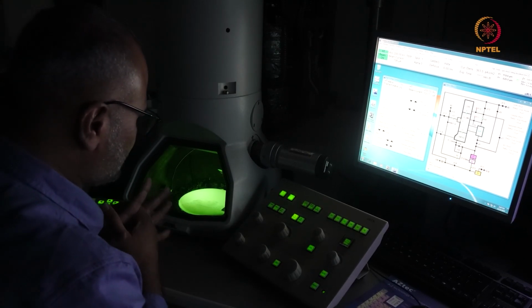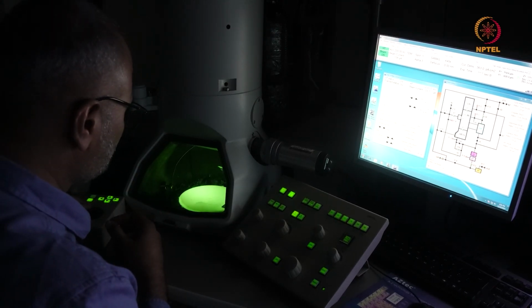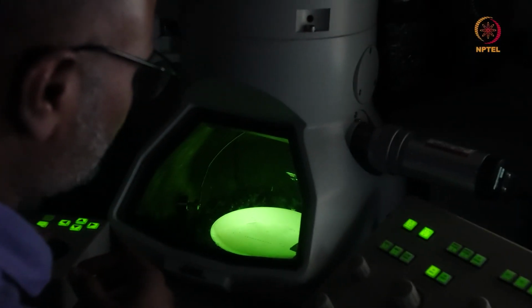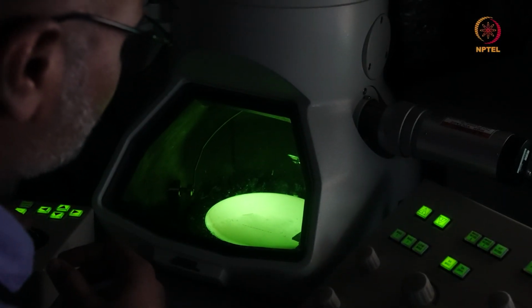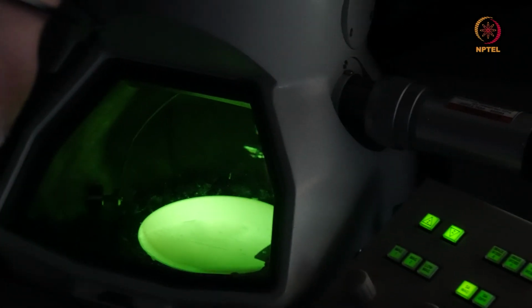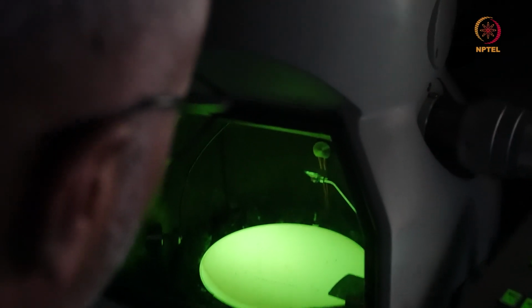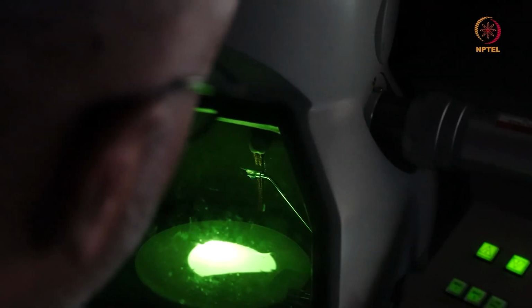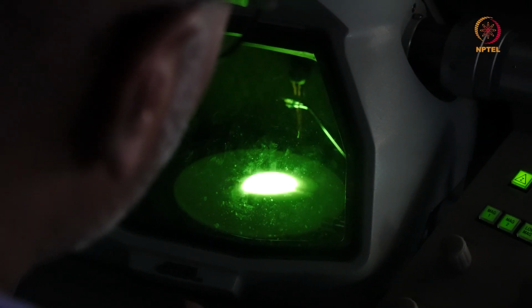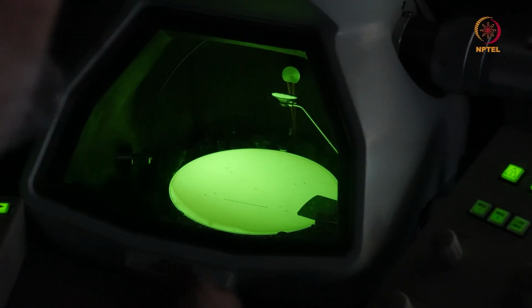Now, after I move the specimen to the right eccentric height, I go into the hole of the specimen. As you can see, I see some kind of a shadow from the edge. This is a metallic sample, and what you see there is basically a diffraction contrast from the grain. If I move it away, I do not see anything here. Right now, no aperture is inserted, and you see this funny shape. When I converge the beam or spread the beam, at the crossover point, this is what you have.